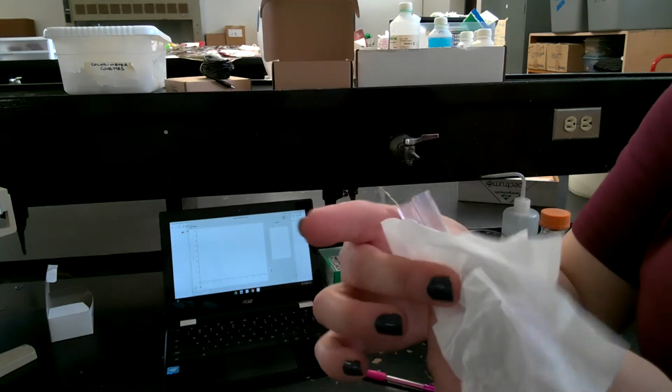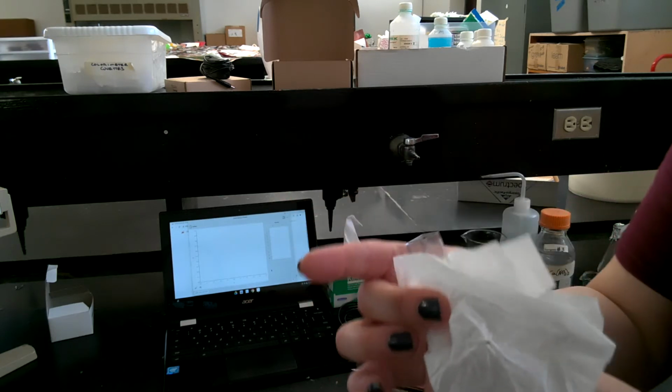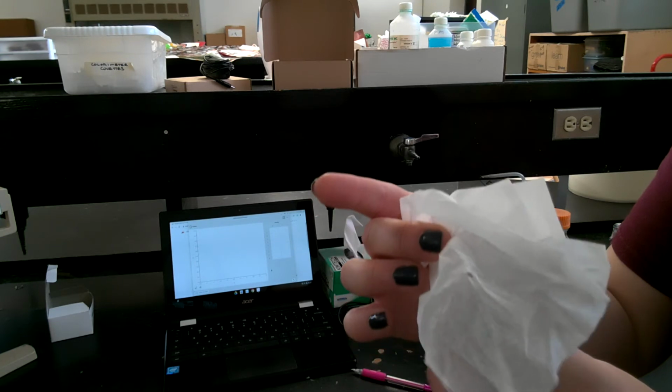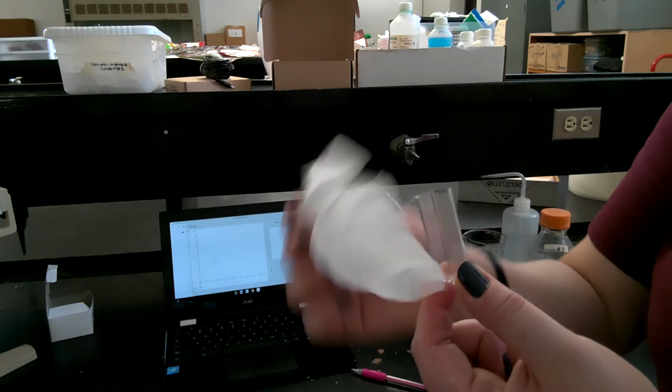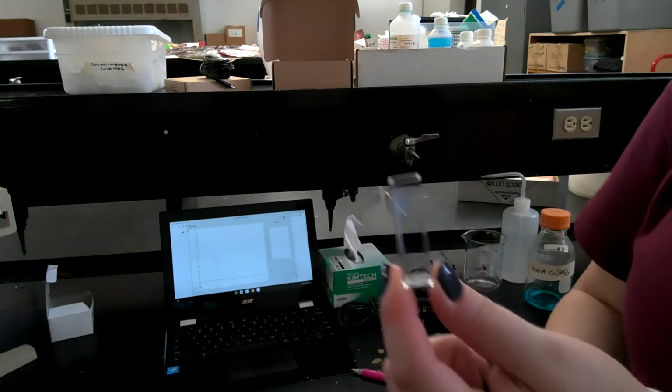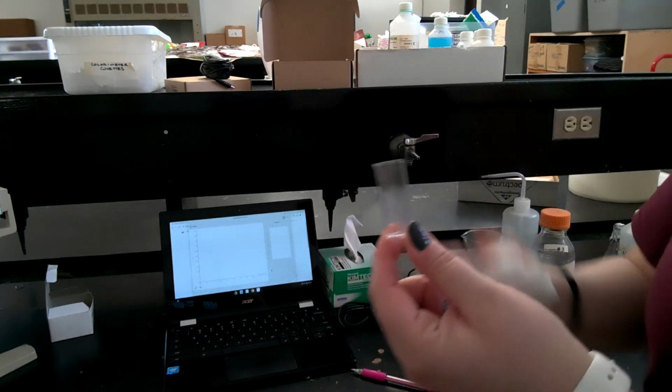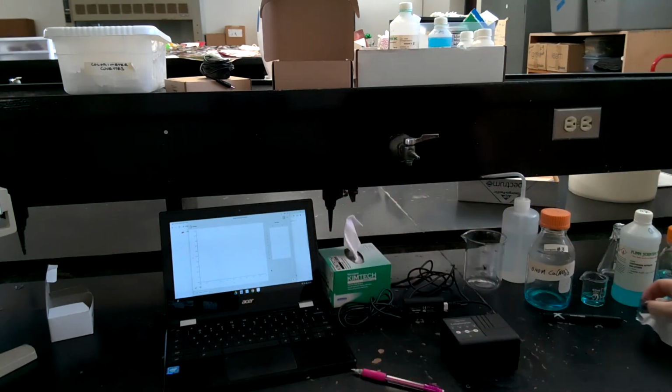Think of it as tissue paper you use for gift wrapping, but because it's chemistry, we give it a fancy name. Then we clean the outside so that light can go through. Okay, so that's my little demo cuvette.